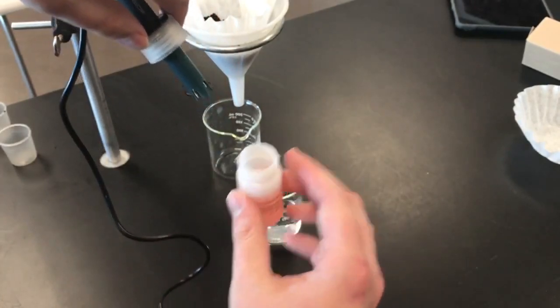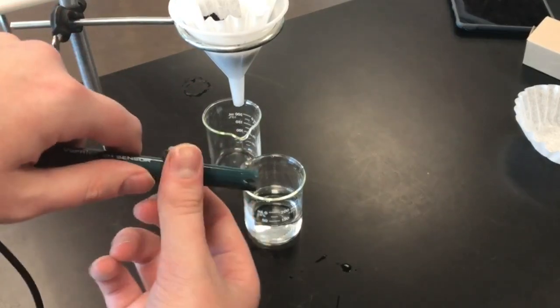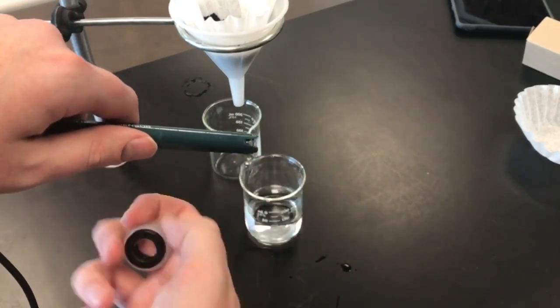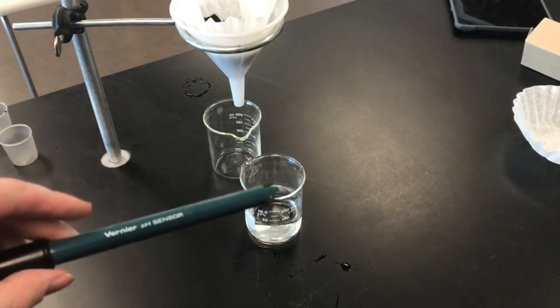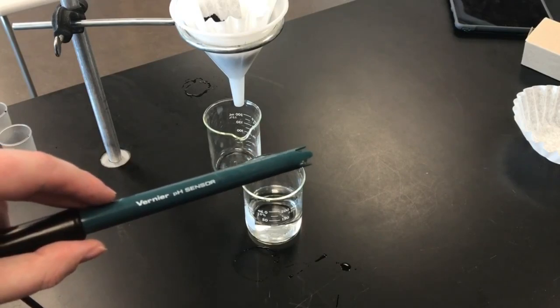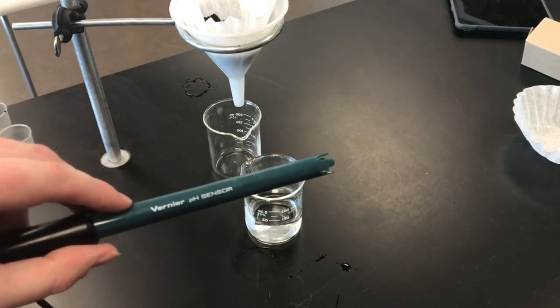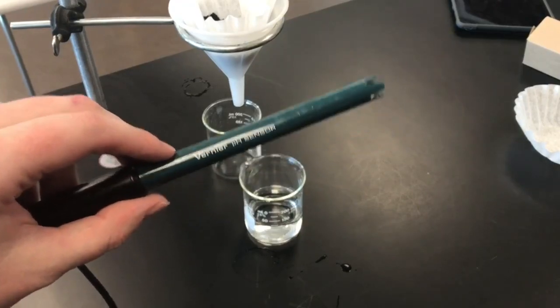so that it looks like this, set the cap down, and then slowly pull this off. So you don't want to just tug at that, you want to take it off just how I did it. These can be very sensitive. So set that sample solution aside for now. Make sure that it doesn't get knocked over, set it somewhere nice and safe.